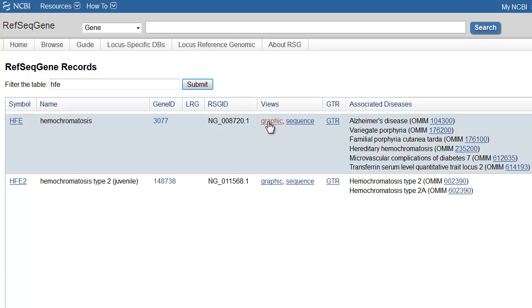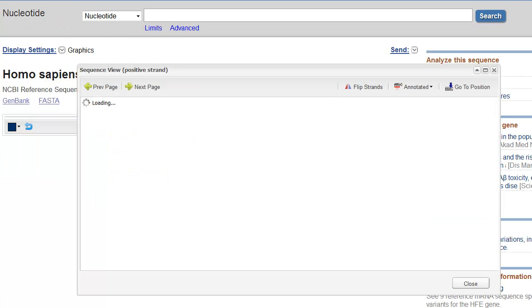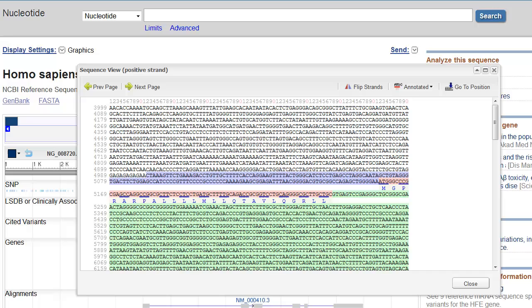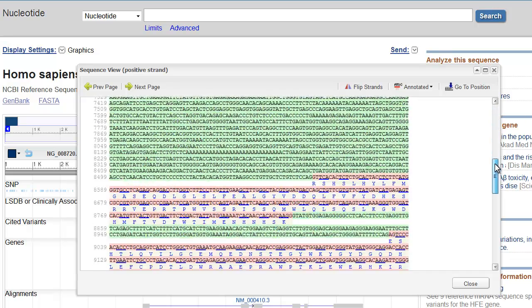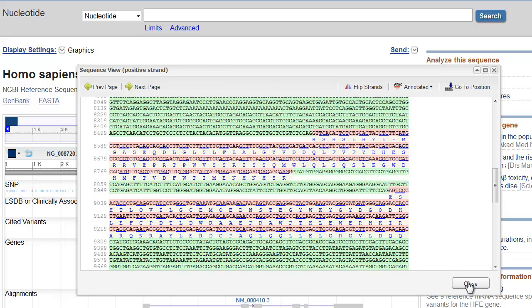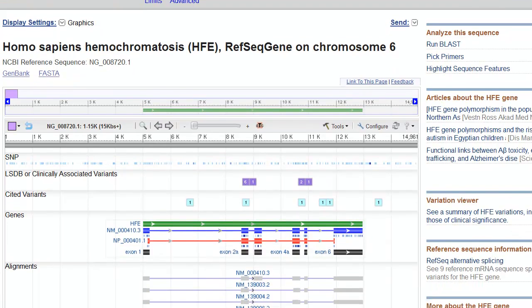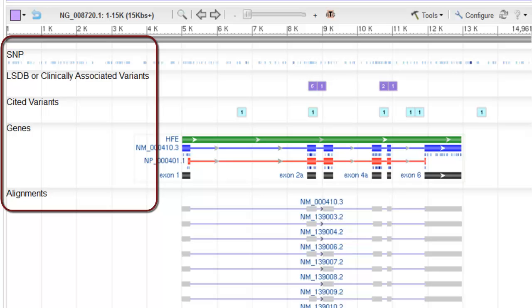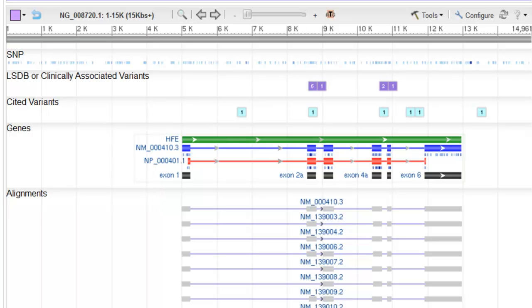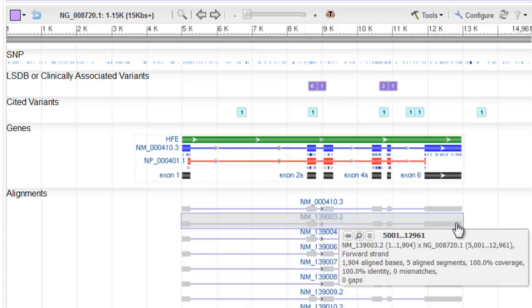This opens the nucleotide record's graphics display, which begins at the 5' end of the gene. I'll close the text display, and we now see tracks labeled SNP, LSDB, Cited Variants, Genes, and Alignments. The first three report placement of short variations, and the alignments show the locations of RefSeq cDNAs.